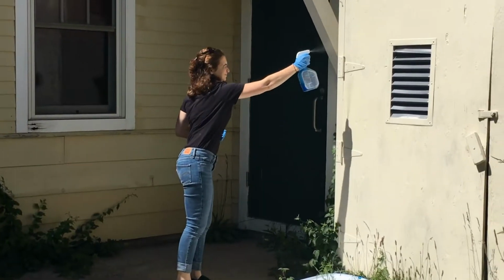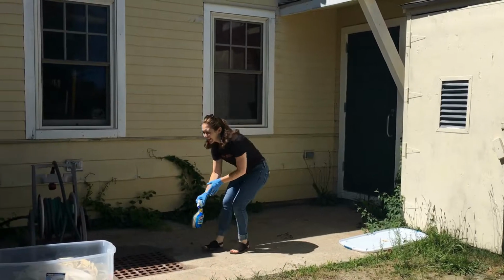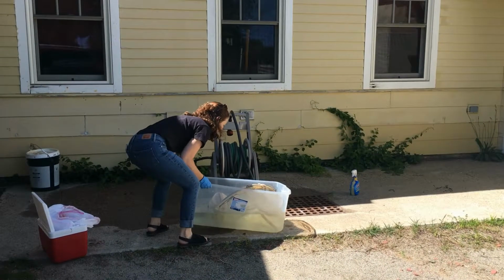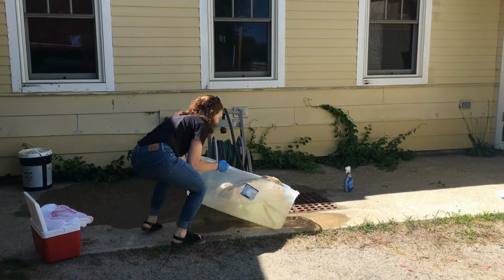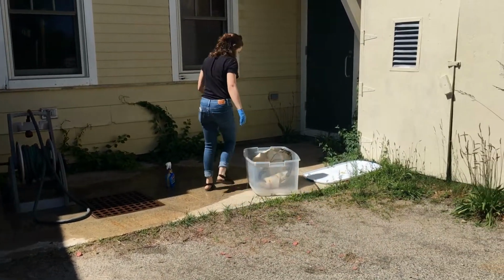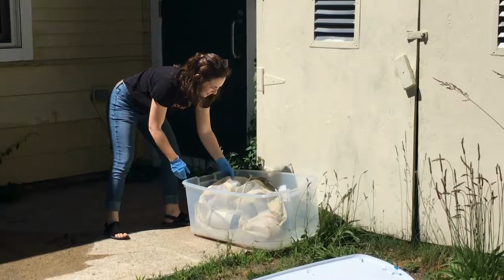You're going to want to be super adamant about where you place your sterile net. That's why I bleached the wall where I'm going to put it. Pour out that bleach solution. Don't ruin your clothes like I have a million times, and hang up that bleached net.